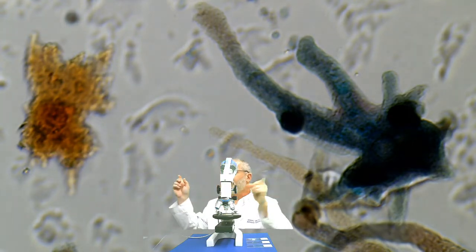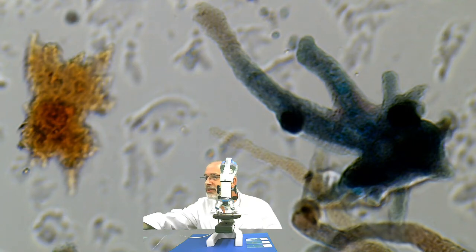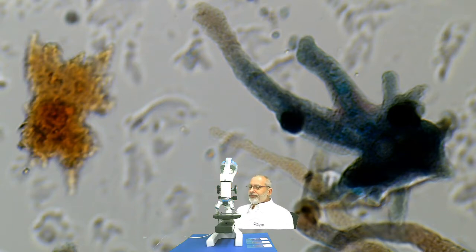You can see some varieties here of the amoeba, but notice, if you will, and I don't know if you can see this with the cursor, but notice up in this darker colored one, these protrusions from the amoeba as you're drawing them. What do you think those are called? I'll give you a hint. They are false feet. That's how they move around.